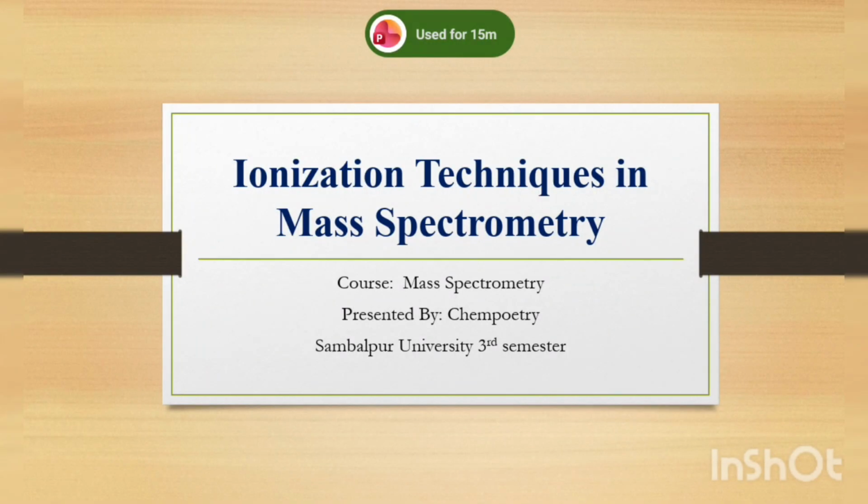In today's class, we are going to discuss a very important topic from Mass Spectrometry, Ionization Techniques. If you are preparing for your PG semester examination, NET GATE, university examination or Viva, this topic is very important because ionization is the first and one of the most essential steps of mass spectrometry.